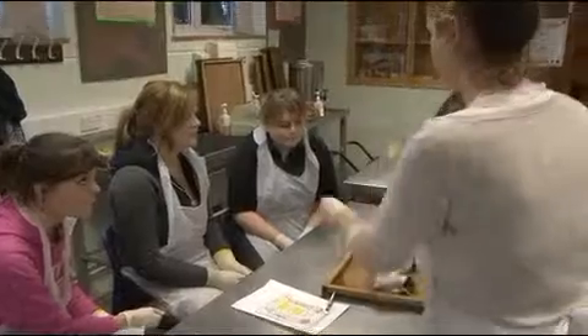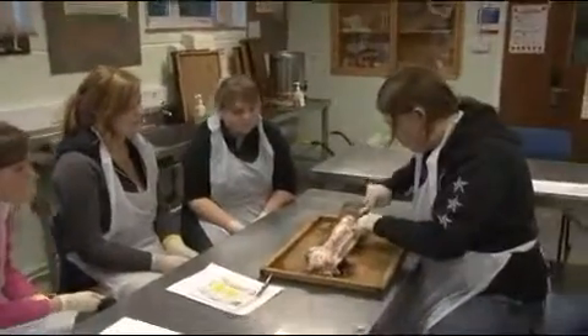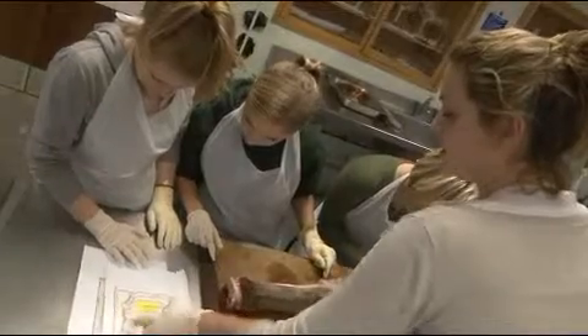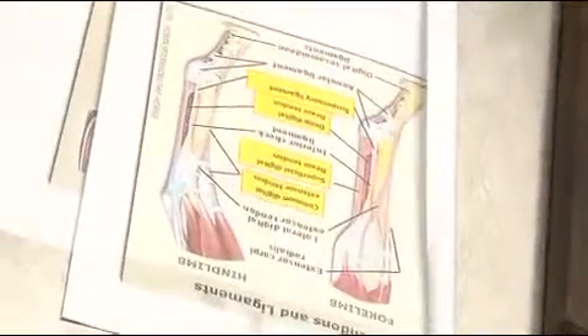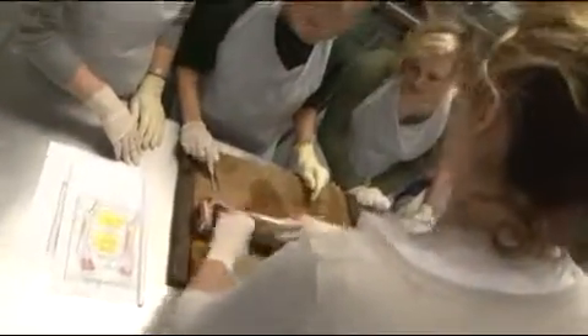Do you remember watching that film about the equine? They snapped it. We're not going to be doing that today, but you're going to have a go at pulling the tendons to see how it makes the leg move. So which one runs right down the front of the leg? The common tendon — this controls the movement of the foot that way. Make sure you leave that on when you skin it.